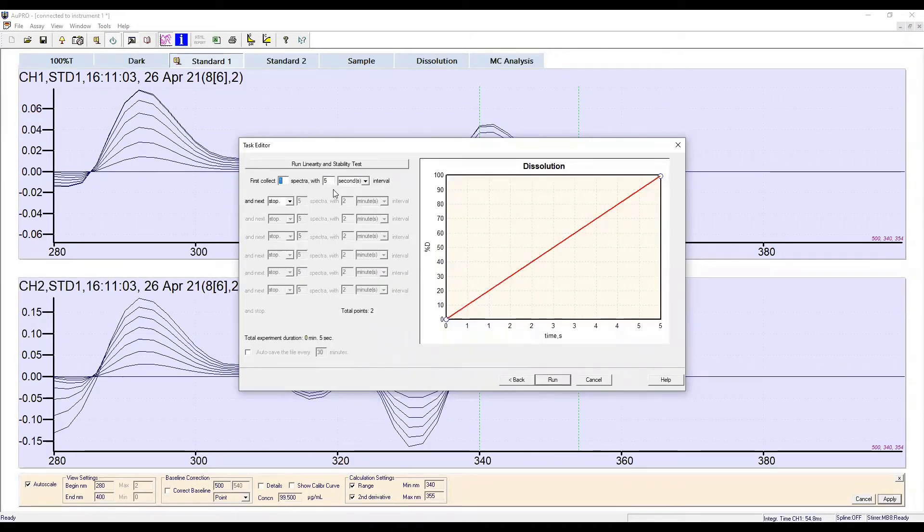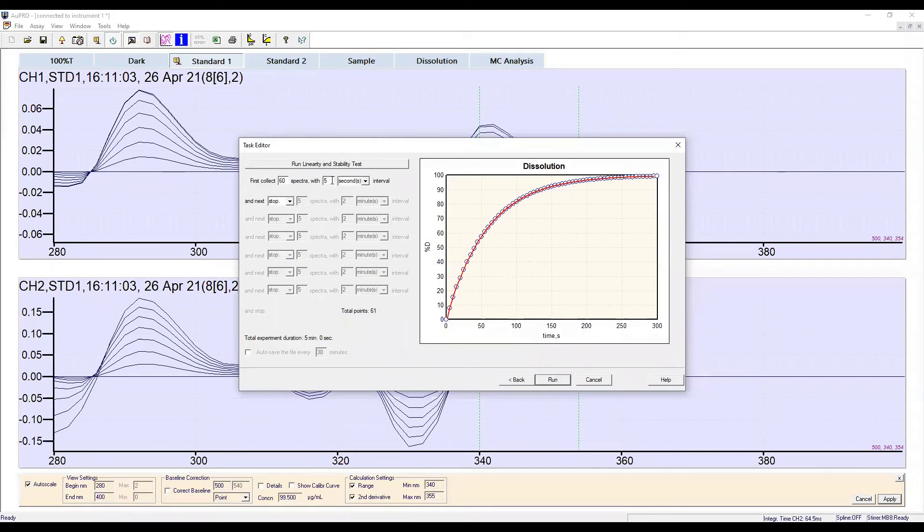The final setup screen is for inputting the number of data points to be collected and the interval between each, thus defining the duration of the assay. Up to seven data collection sectors can be defined, allowing the user to collect data at different frequencies depending on the stage of the assay. The autosave feature can also be switched on at this stage.